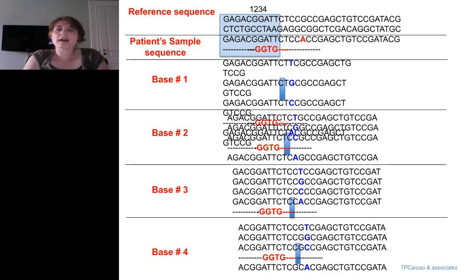If you look here, we have a G in our reference genome and an A in a patient sample. And this line got completely out of whack here. That G should be under the A. And basically what happens is that you read along the sequence. So if you imagine having your reference sequence tiled in 25 mers underneath, and the 13th base is always the one read, this is really how it works.